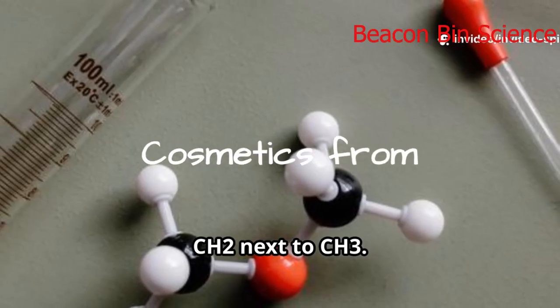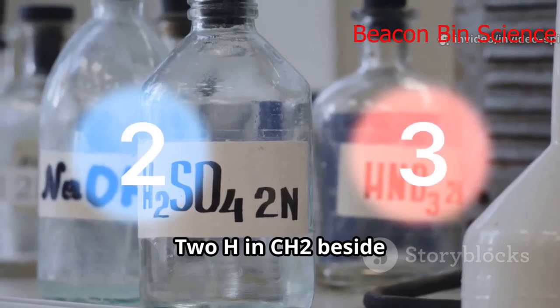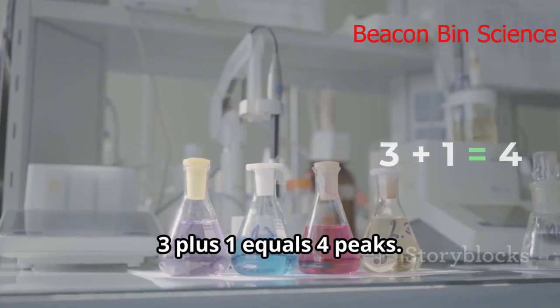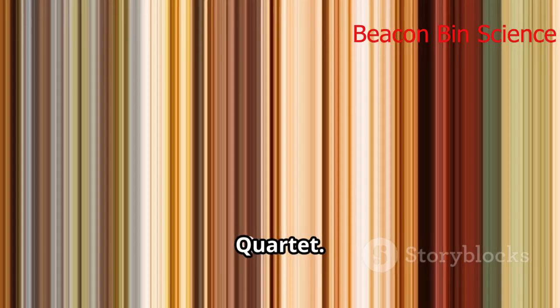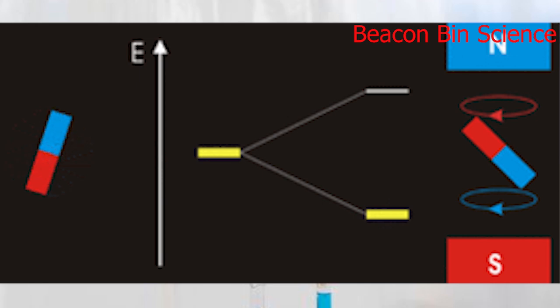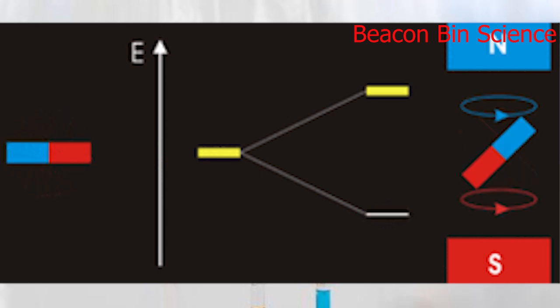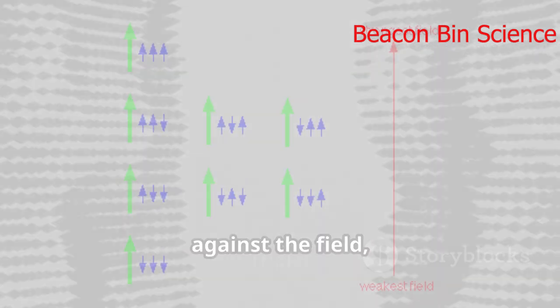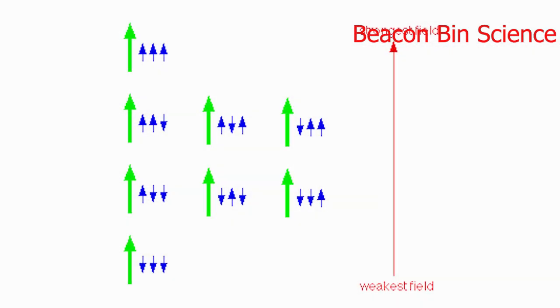CH2 next to CH3. 2H in CH2 beside 3H in CH3. So CH2 splits into 3 plus 1 equals 4 peaks. Quartet. CH3 is next to 2H from CH2, so CH3 gives 2 plus 1 equals 3 peaks. Triplet. Why? Each neighbor can align with or against the field, creating slightly different environments.